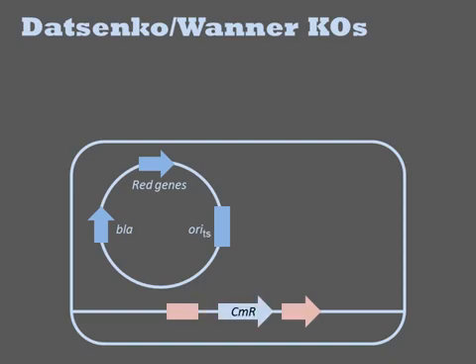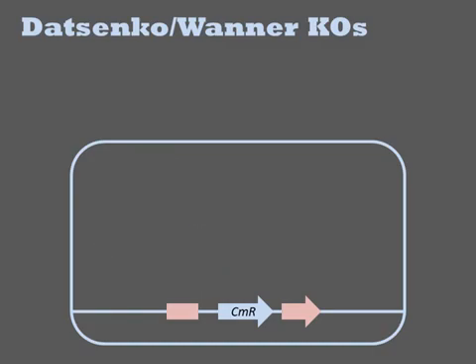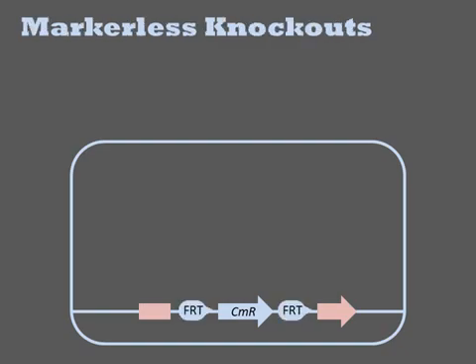Inside the cell, the lambda-red genes cause the double crossover recombination of the PCR product over the sequence homologous to the ends in the target. Because recombined cells contain the chloramphenicol resistance gene, they can be selected by growth on antibiotic-containing medium. The helper plasmid pKD46 is then cleared from the cell by growth at elevated temperatures. This results in a strain in which the target sequence has been disrupted.